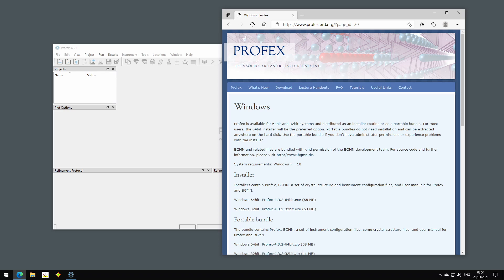So if you are using version 4.3.1 from the installer package on Windows, you can now follow the steps I'm going to show to upgrade to the new version 4.3.2 and to any coming version in the future.